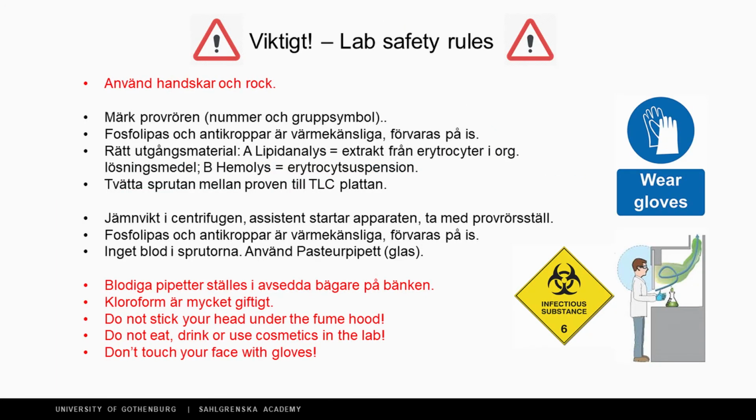Please also take some time to familiarize yourself with the lab safety rules. These are very important for this lab and any other. The most important one is to always wear lab coats and gloves to protect yourself. Make sure you know the safety requirements of all reagents that you use and which ones you need to handle with particular care.